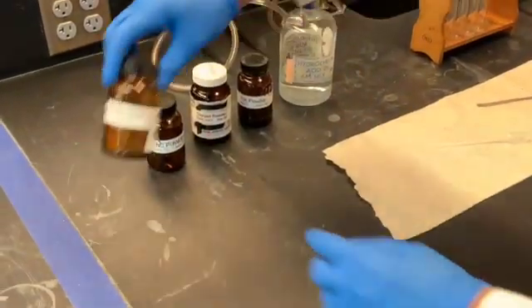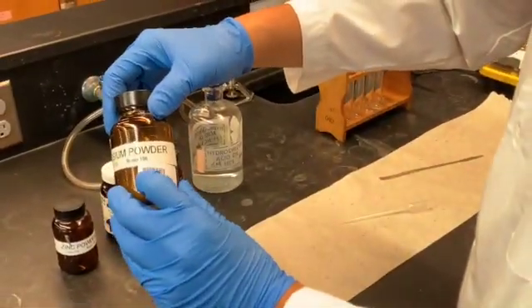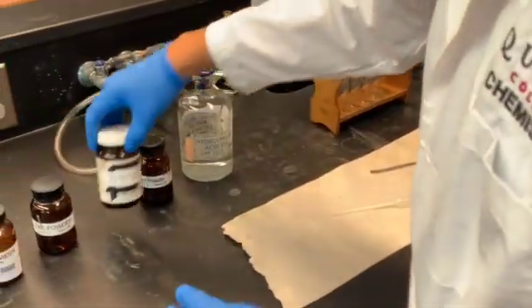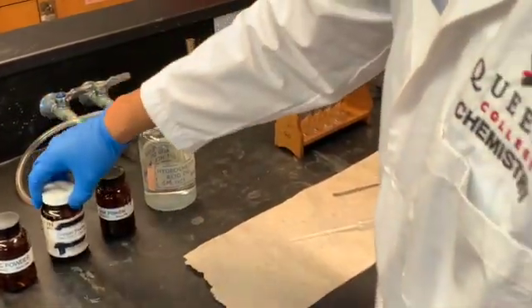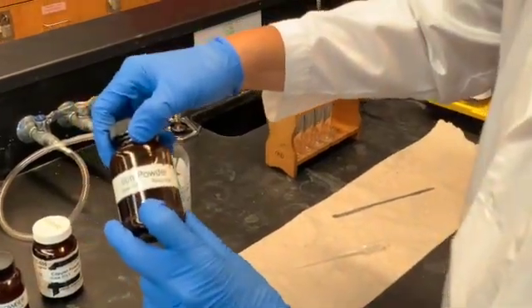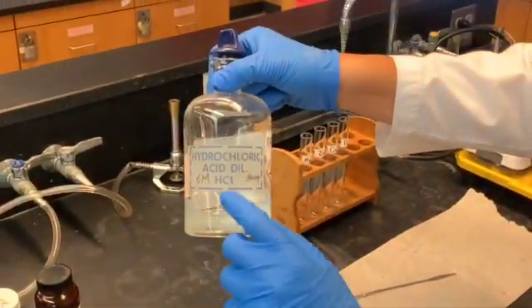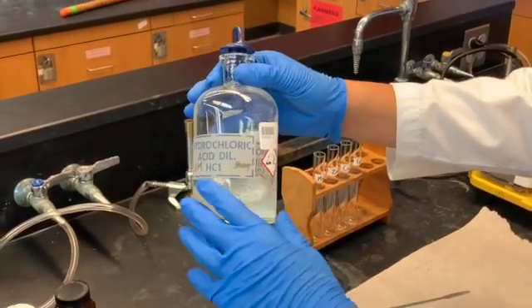The chemicals that we'll be using are magnesium powder, toxic; zinc powder, toxic; copper powder, toxic; iron powder, toxic; and six molar HCl, which is corrosive — you should wear gloves while handling this.